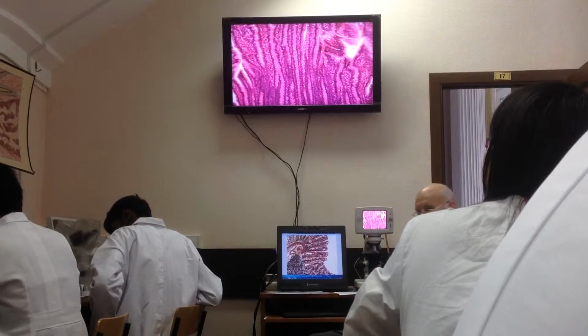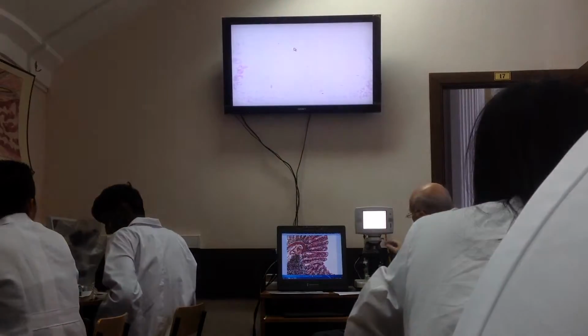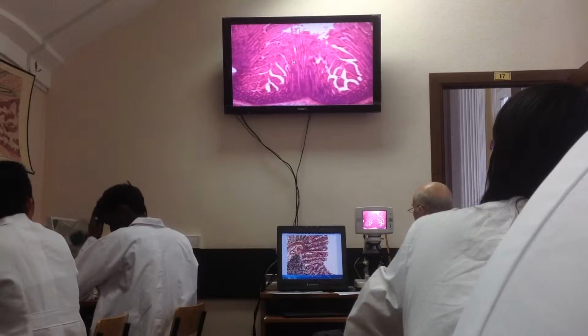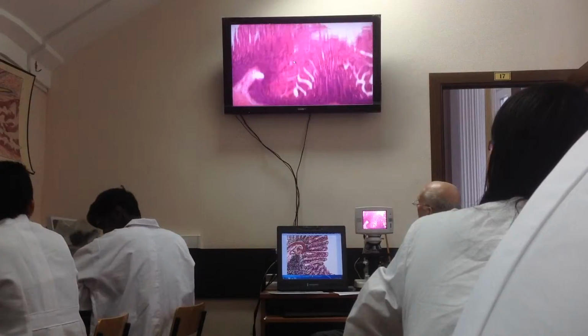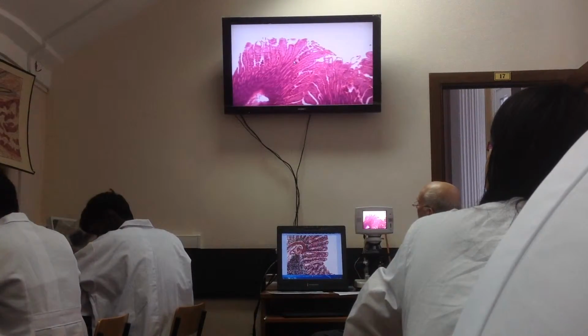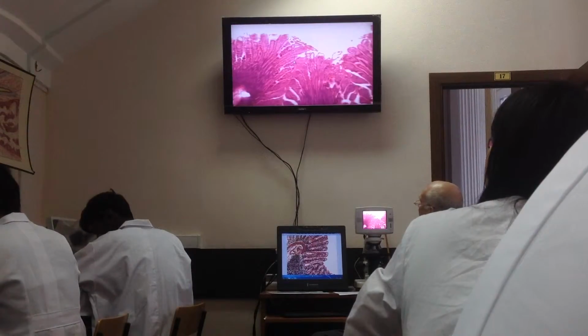But now you must differentiate. Small or large? To differentiate, examine once more micro-relief and try to differentiate the structures present in this.